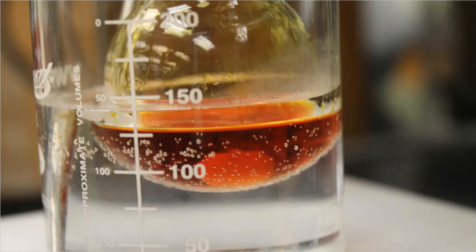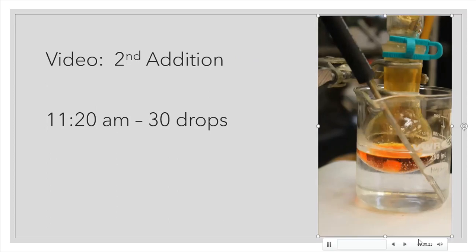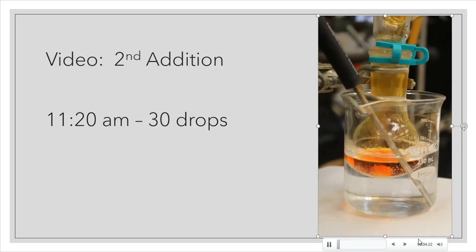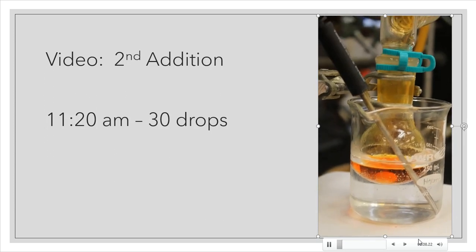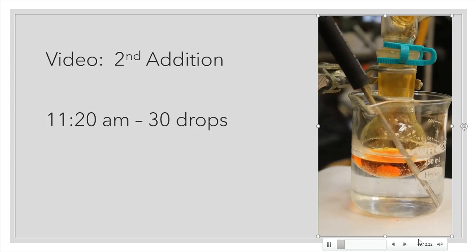All right, so I add more bromine, and that goes darker, which makes sense. And that happened at 11:20 a.m., and I added another 30 drops. So I'm on my second addition for the bromine and the trans-cinnamic acid, and I want you to take a look at the color again. I just added it, and you can see how dark of an orange color that it is.